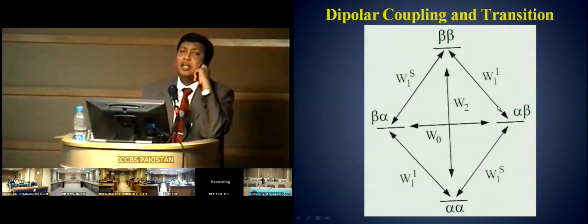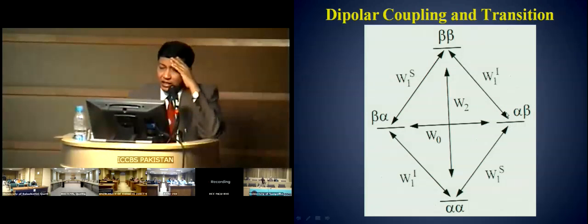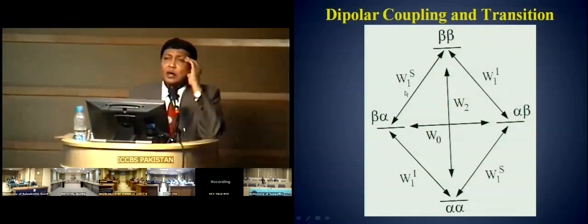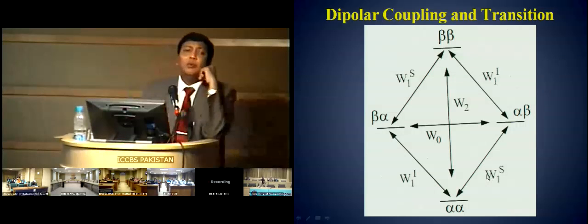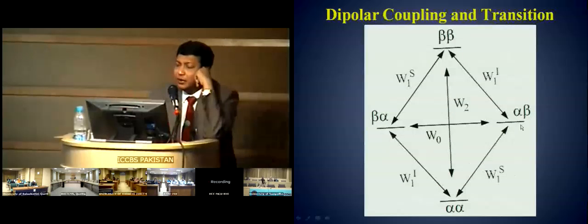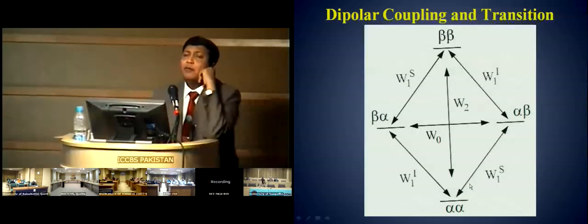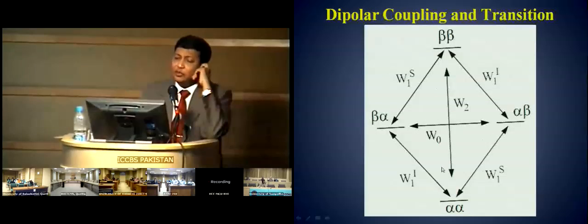The same, remember the INEPT, the polarization transfer diagram which I was showing to you, since they are influencing each other, this W1 is always a single quantum transition. Only one of the spins changes the orientation. Okay? In a normal world, when you remember INEPT, in which I didn't really show you anything in between.